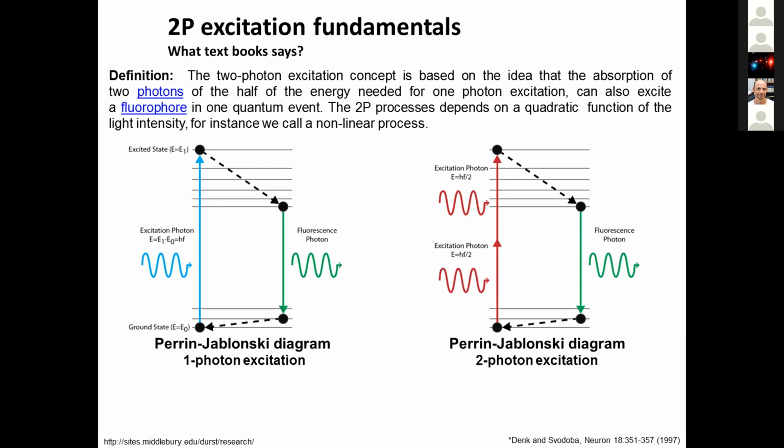And this struggled my thought about how this happened over the years. And until I put time into it, I never understood why this happened. And well, as Dave explained before, we have excitation in the Jablonski diagram, and then we have some electronic rearrangement before the emission. Well, if we talk about time, the excitation is usually on the femtosecond time scale. Then we have relaxation on the picosecond time scale, and the emission takes on the order of nanosecond time scale.